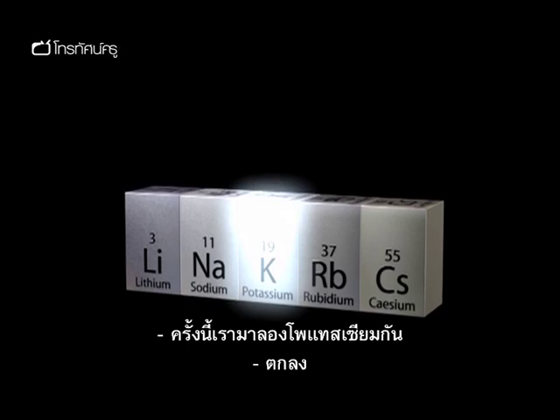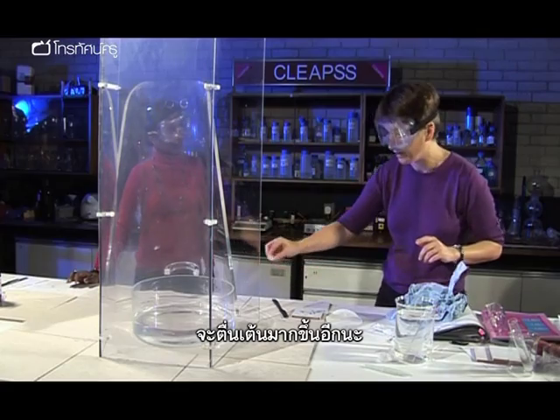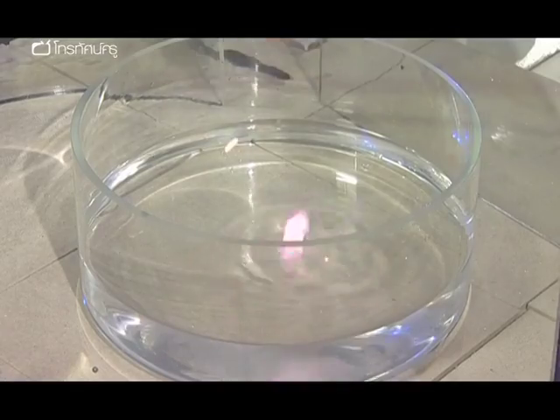Let's have a go with potassium this time. Okay. Should be a bit more exciting. Definitely more reactive.